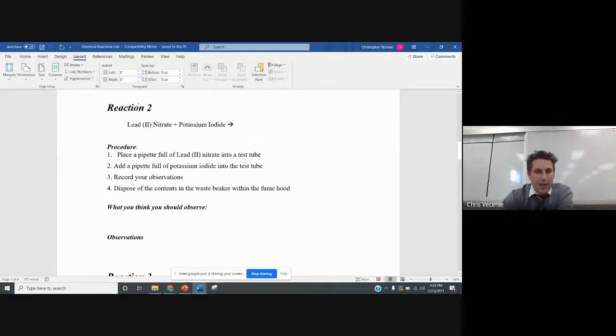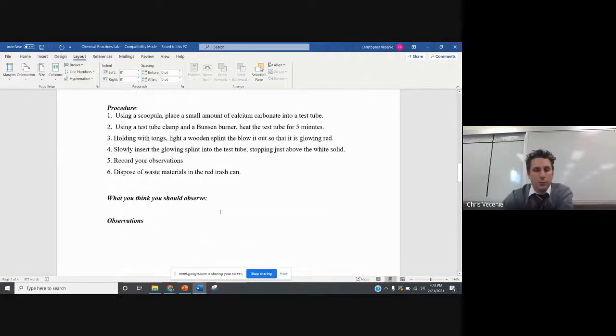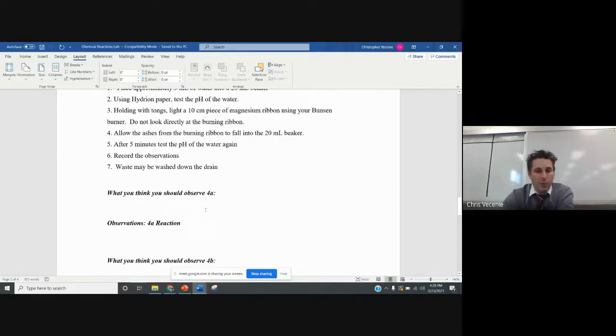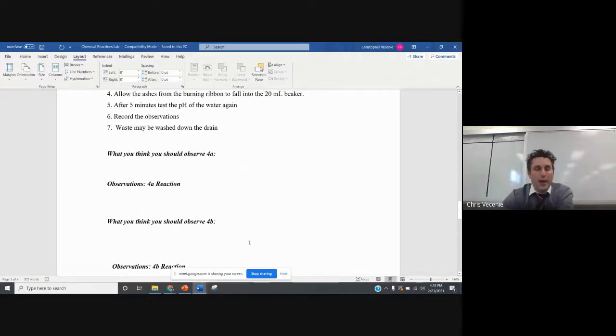You do that for reaction 2: predict it, write it, balance it. What do you think is going to happen? 3, predict it, write it, balance it. What do you think is going to happen? 4, 2 reactions in number 4. 4A is the magnesium plus the oxygen. Predict what you think will happen for 4A. 4B is the magnesium oxide plus the water. What do you think will happen there?